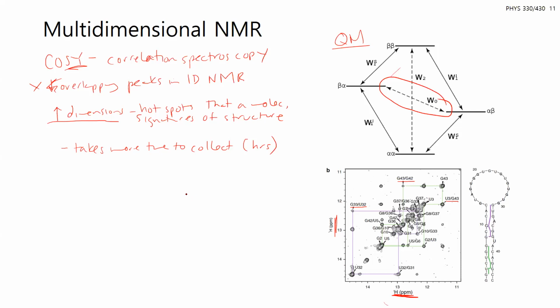And this transfer of spin that I mentioned, you should be familiar with this term of nuclear Overhauser effect, or NOESY. The NMR people, more familiar with this, can correct me if I'm pronouncing these wrong. Yeah, it's nosy. Sorry? It's nosy.